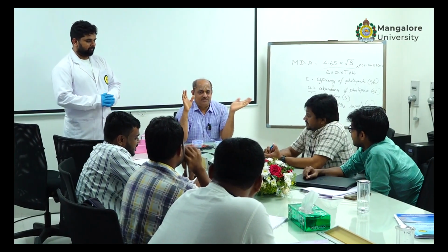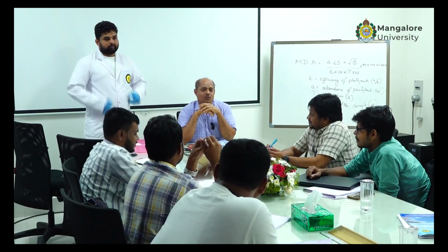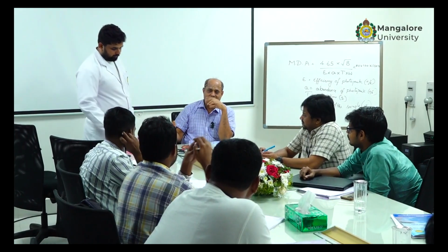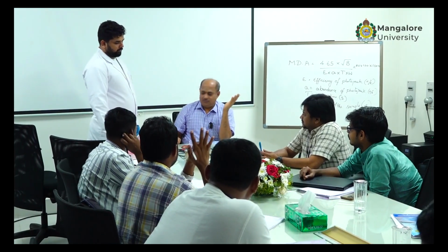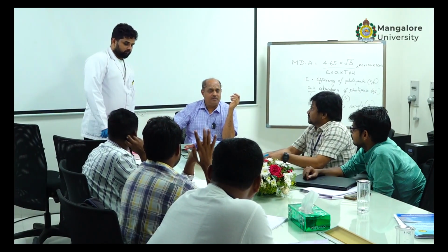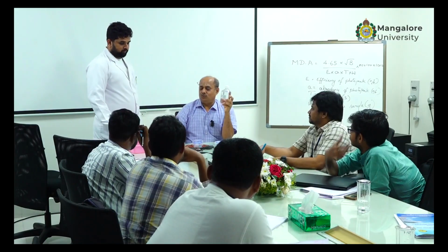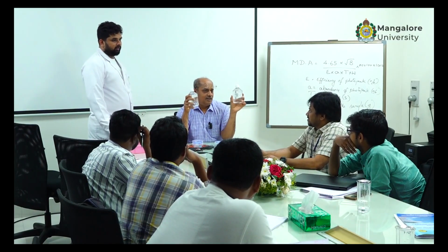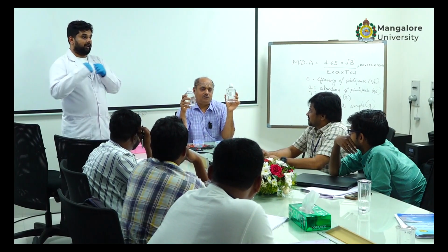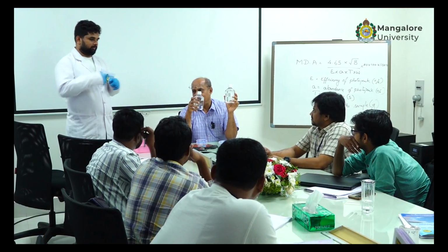Okay. Any input is required from our side? No. Then Avanish, give them one batch. You take this water sample and count, but be careful. Ensure that it doesn't fall down, because in case it falls down, everything will be contaminated.